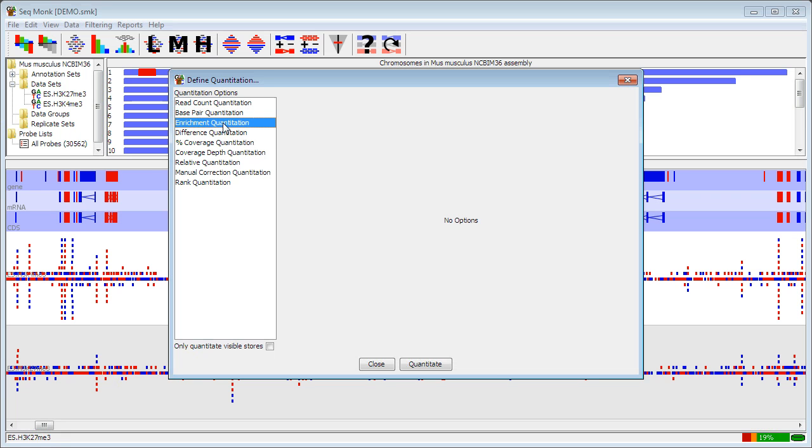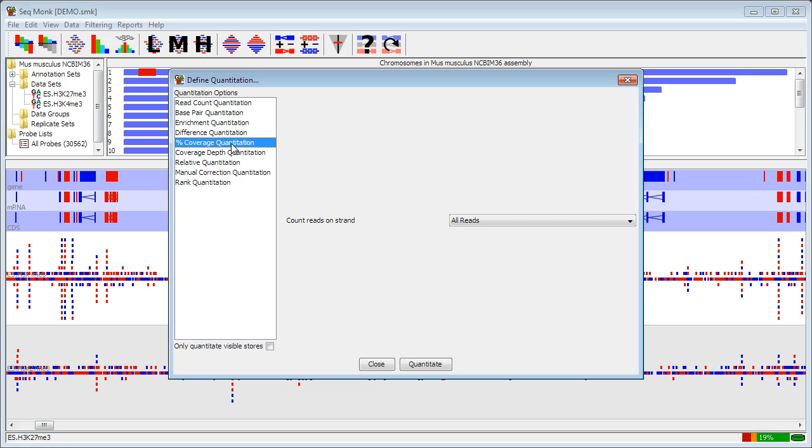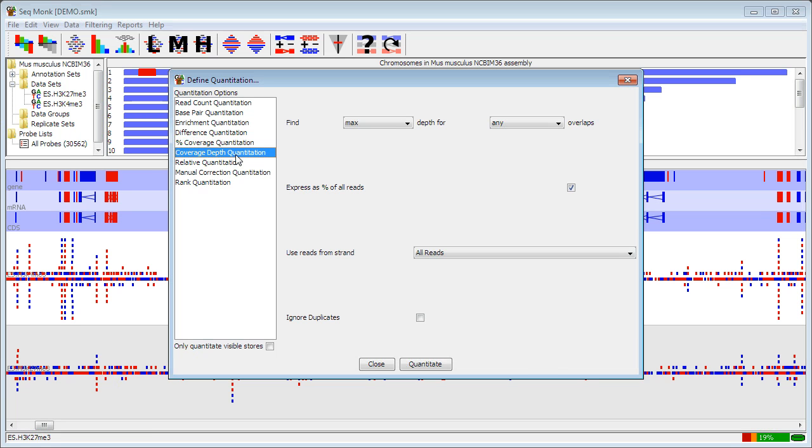Enrichment quantitation is designed to be the simplest quantitation method. So it just measures how many more reads you've got overlapping with a particular region than you would have expected just by randomly distributing them. So it's a very simple quantitation option with no options, but it's a good starting place if you don't know what else to do. Difference quantitation allows you to use the strands of your reads as part of your quantitation. Percentage coverage quantitation just says what percentage of each probe is covered to any depth at all by a read. Coverage depth quantitation looks for the maximum or minimum degree of overlap between reads within a probe.